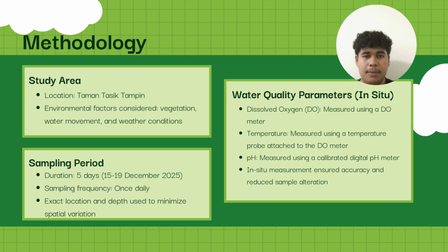For the water quality parameters in situ, we measured the dissolved oxygen using a DO meter.